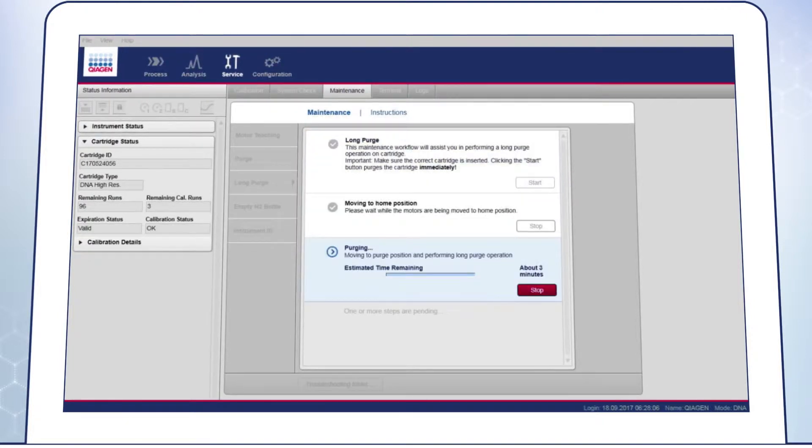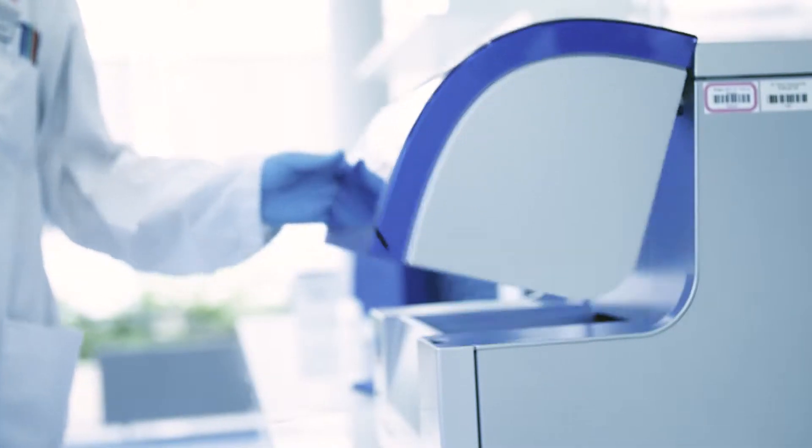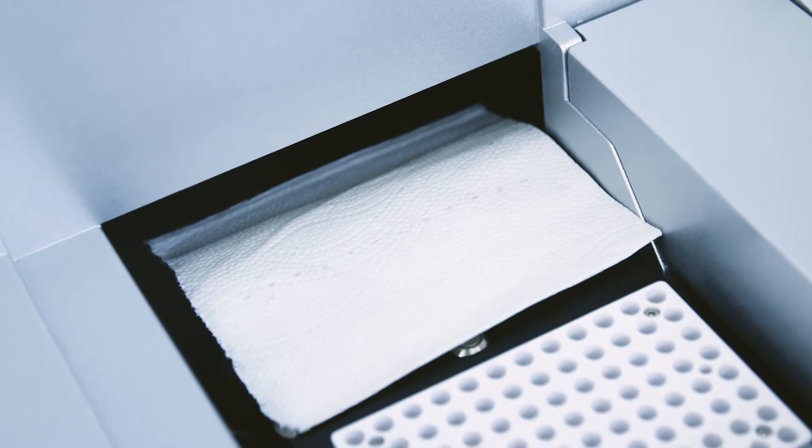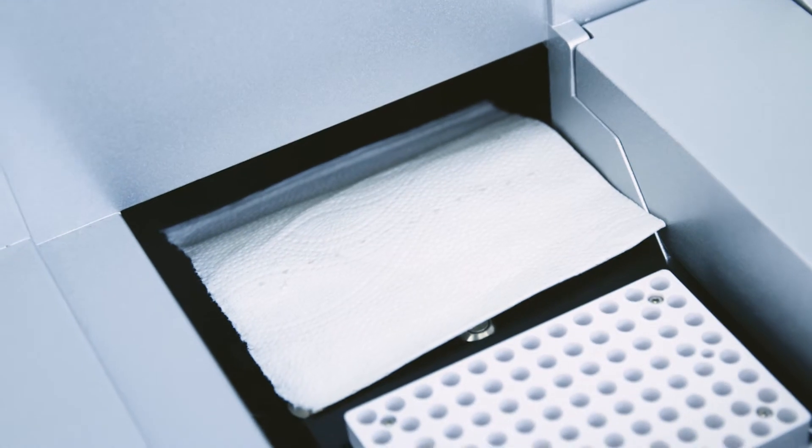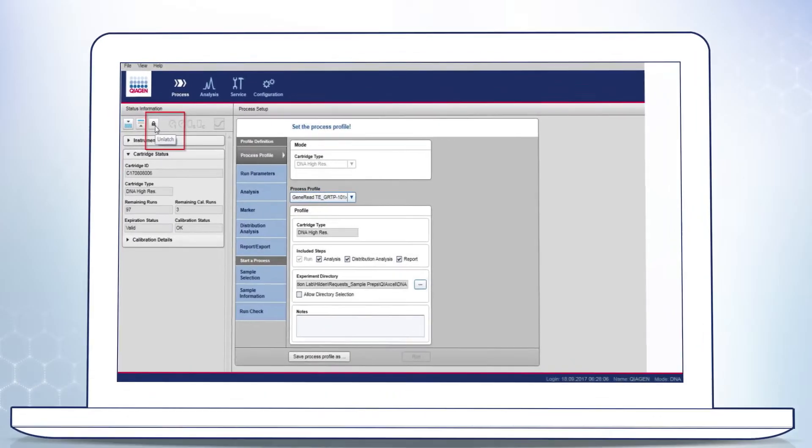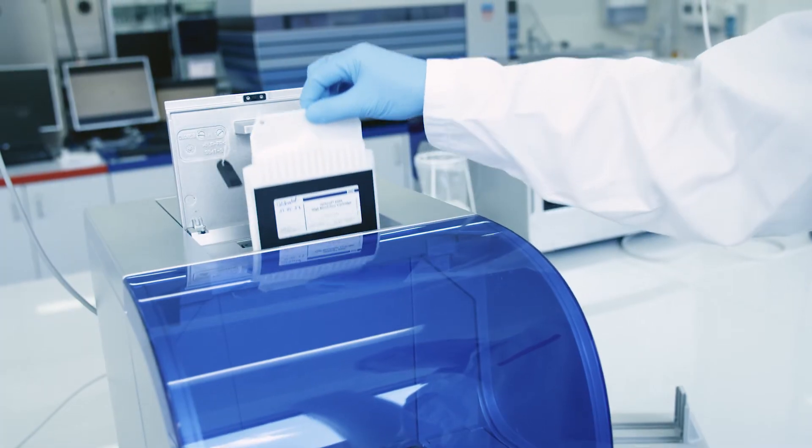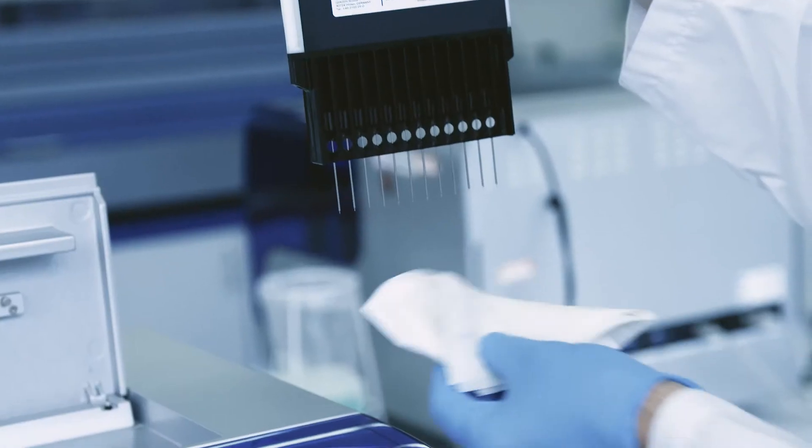The purging process automatically stops after 3 minutes. Then open the sample door and check the tissue. If all capillaries have generated homogeneous gel droplets, click Unlatch and remove the cartridge from the instrument.